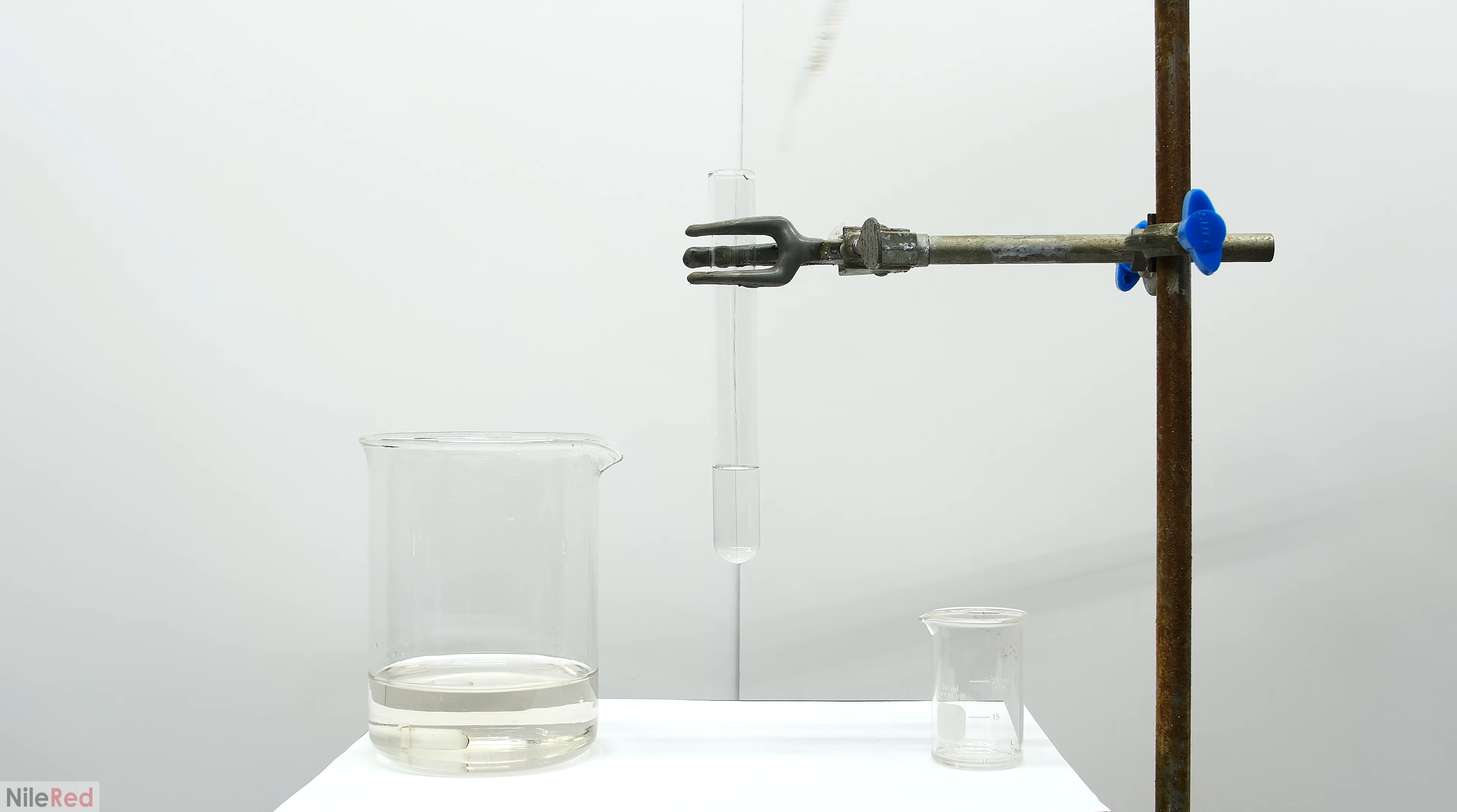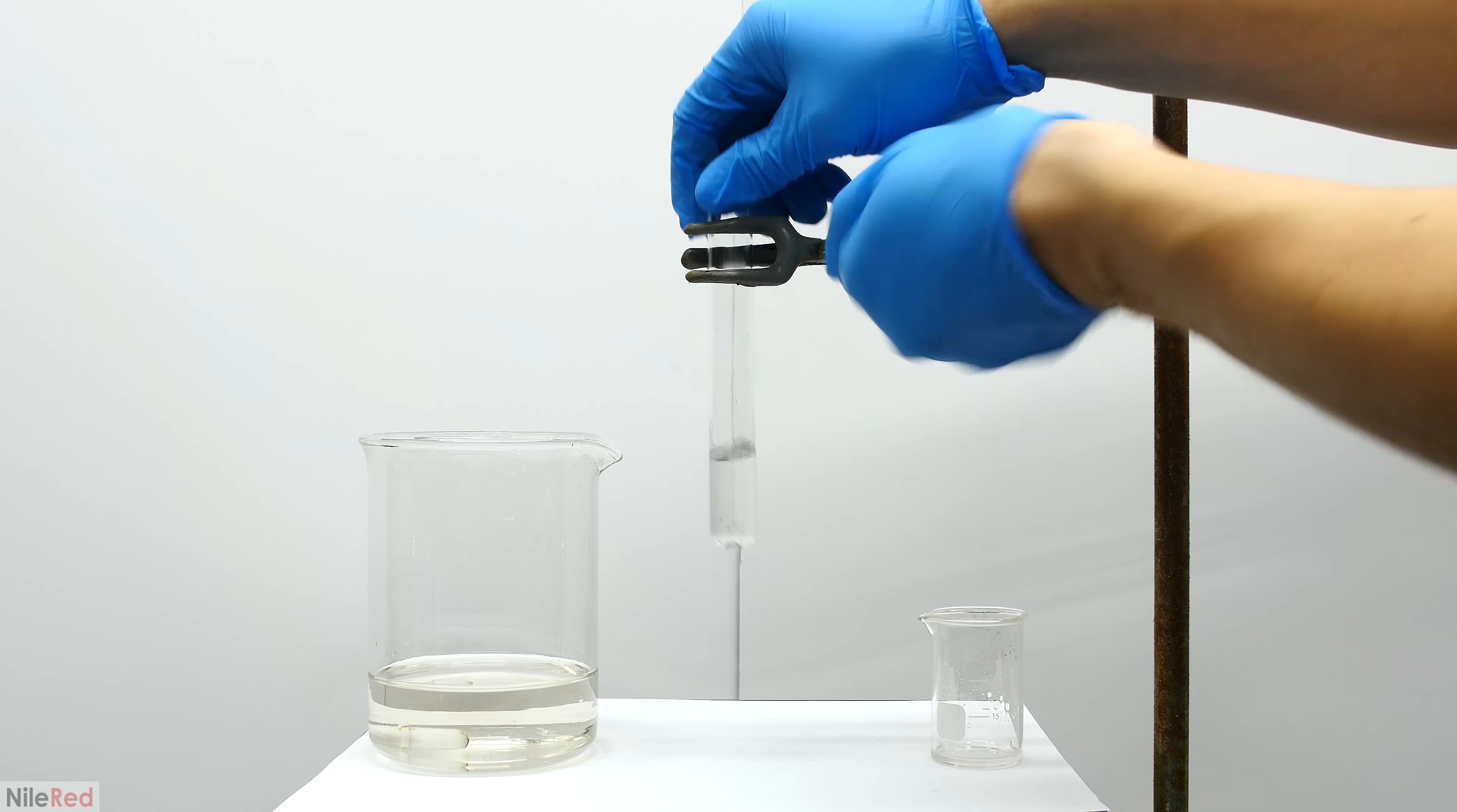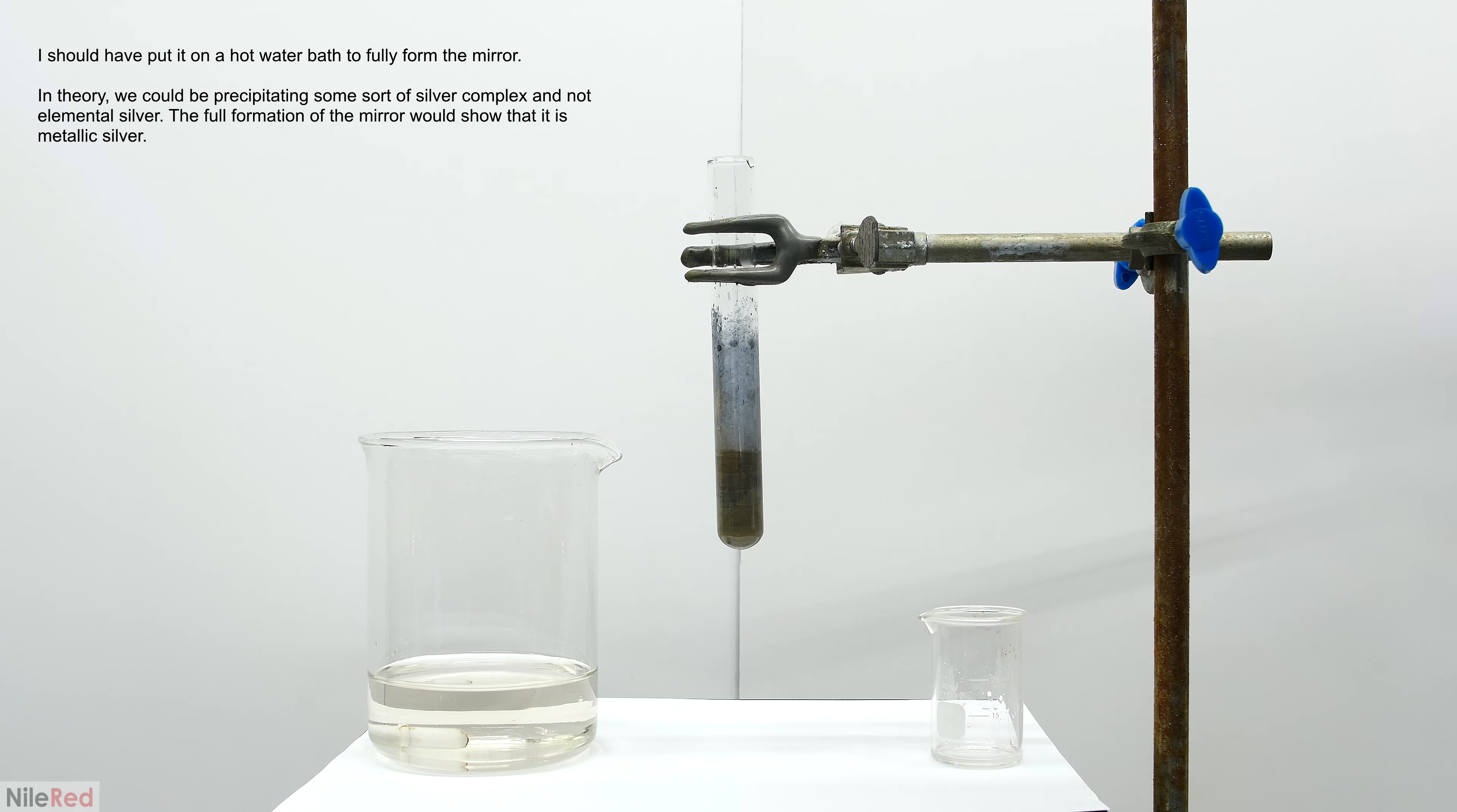With the Tollens reagent in the test tube, I go ahead and add a few drops of the first unknown. Before I even take it off the stand, we can already see some silver forming. When I shake the test tube, a lot of silver starts to fall out of solution, and we can see a mirror forming on the sides. This is a very strong positive, and it's highly suggestive that we have an aldehyde present.